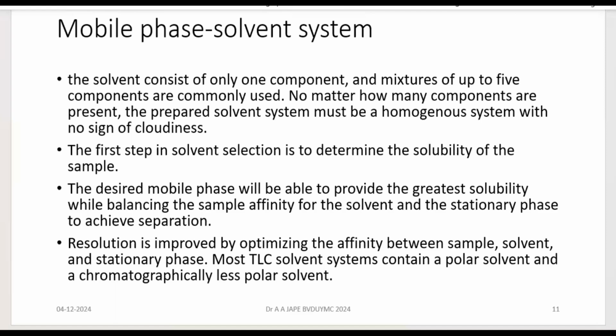So, selection of the mobile system should be such that you have to take into consideration the polarity of the analyte and the polarity of your mobile phase, and then how well it is going to be solubilized in it and how strongly it is going to interact with the mobile phase. At the same time, partitioning has to occur. The analytes have to get separated. So, selection of a solvent system is the step that requires research. Of course, there are other factors apart from optimum separation that are to be also considered before we go for the choice of a solvent system.